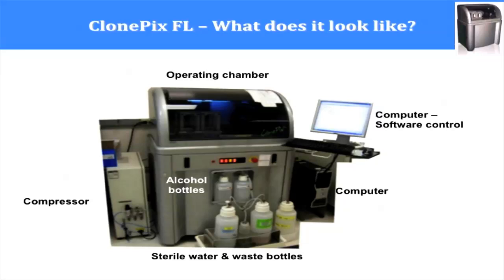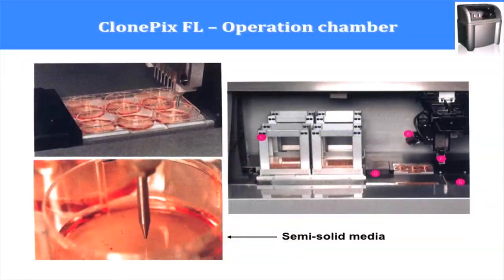So this will pump the water to flush the tubing system, and the waste will come out from the other side. We have the compressor here, and we also have the computer with the image analysis software on it. So now let's look into the operating chamber.